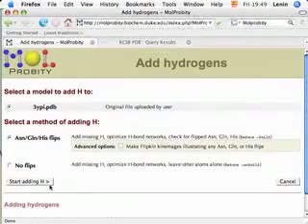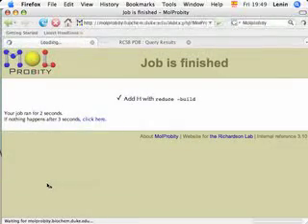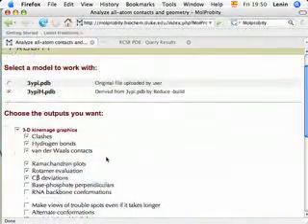At this point we can download the results, however we won't do that in this tutorial. Once protonation is completed, we will continue to the all-atom analysis. The length of this analysis is directly related to the size of your structure.